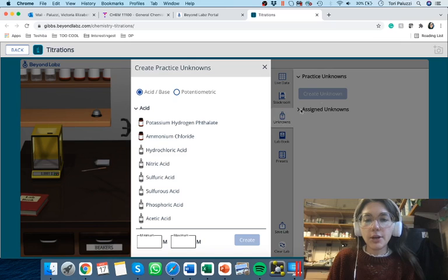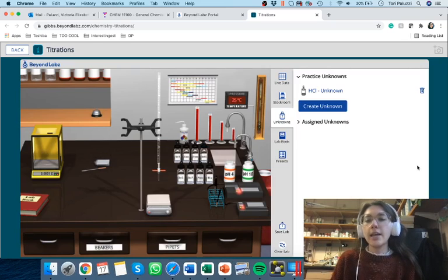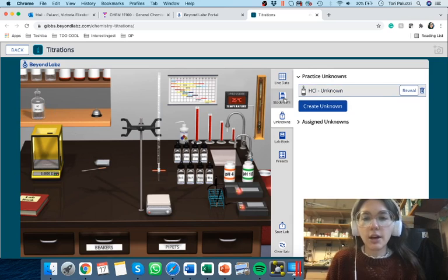So you're going to go to unknowns, create unknown, acid base. You're going to click on hydrochloric acid, and anywhere between 0.1 and 0.12 is fine. Hit create, and you're going to go back. Oh, and then you're going to click it, and it'll magically appear here. Thank you, invisible stockroom person.